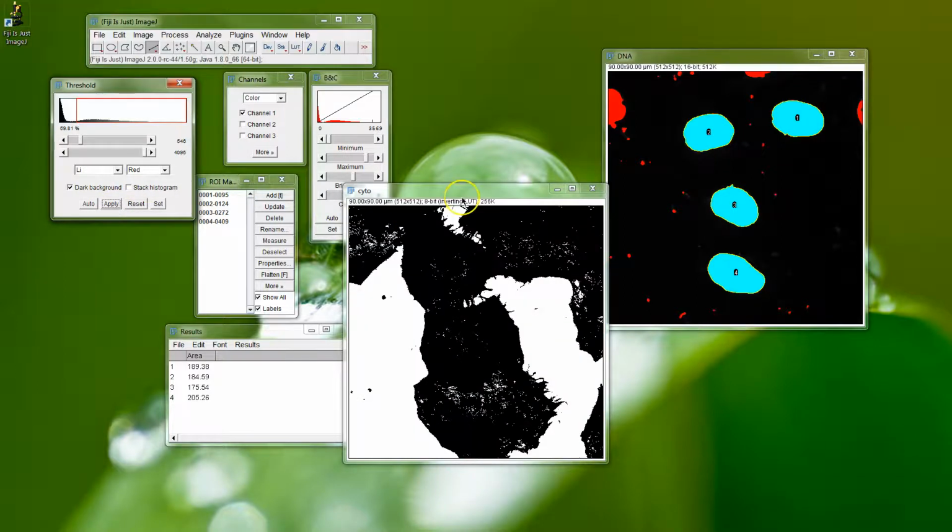Then this time we're going to hit apply, and it's going to turn it into what's called a binary mask, and technically there should be zeros and ones. If you look here, it's 0 in the background when I look at my value up the top here on the ImageJ window, and the value itself is 255 for the black. This is the inverse, and you can see at the top it's inverting the LUT for this mask, and this is the inverse of a standard grayscale lookup table where 255 in this 8-bit range would be white and 0 would be black. So it's the other way around. It doesn't matter too much.